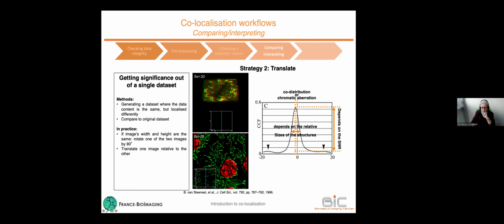You see, as we are coming closer to a zero displacement, the correlation coefficient is going up and it's going down on the side when I've got a huge displacement between my two images. So this means that indeed, I'm starting with this zero position where I've got the maximum of correlation, and going in both directions, I'm losing correlation, meaning that the correlation is specific.